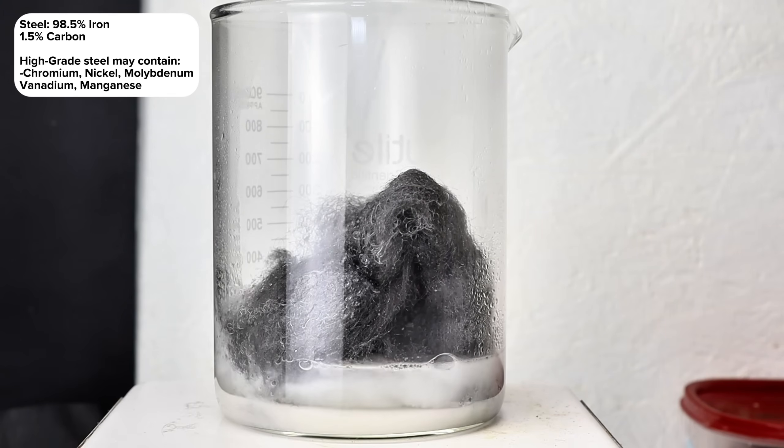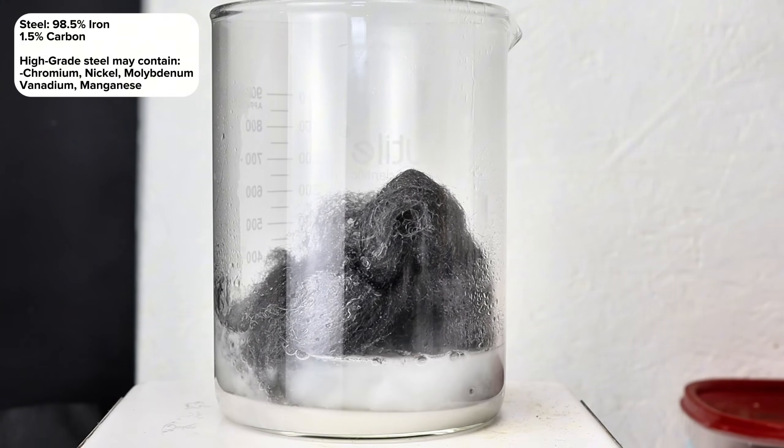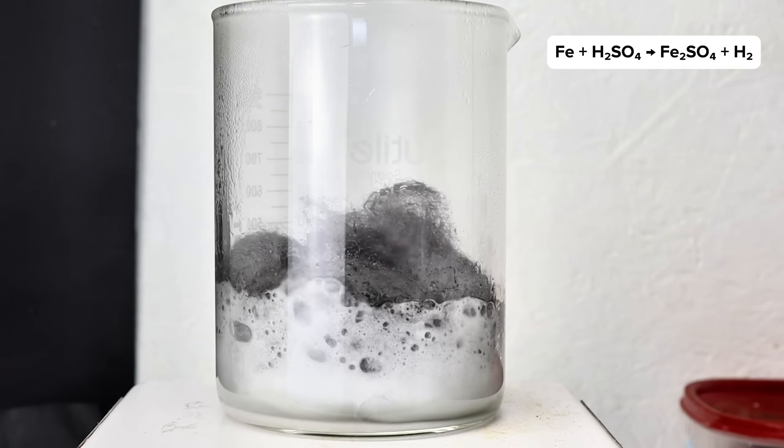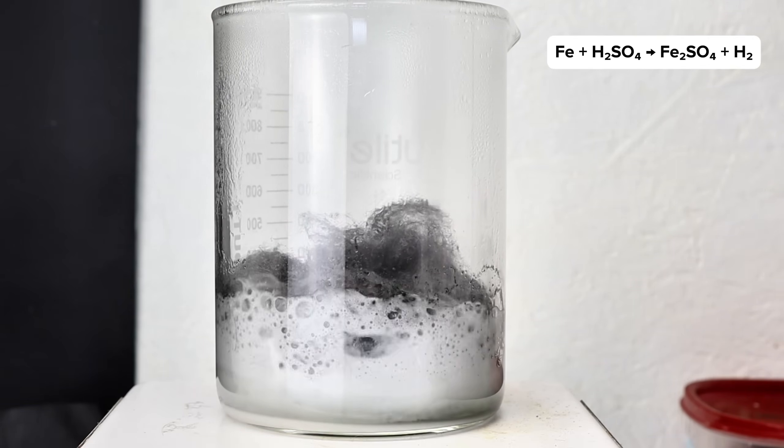When iron reacts with sulfuric acid, it'll form iron 2 sulfate and release bubbles of hydrogen gas. This is a pretty straightforward single replacement reaction, but it's always fun to watch.